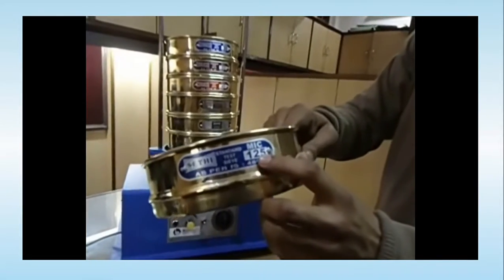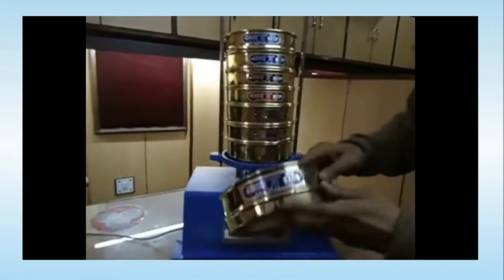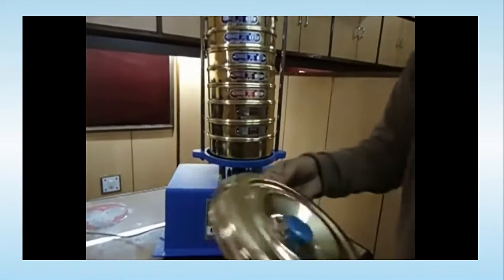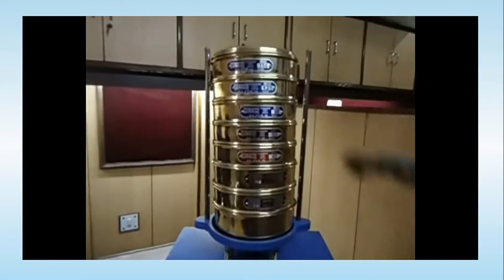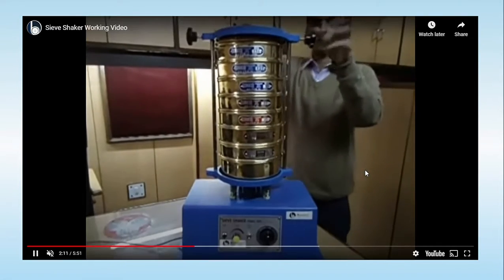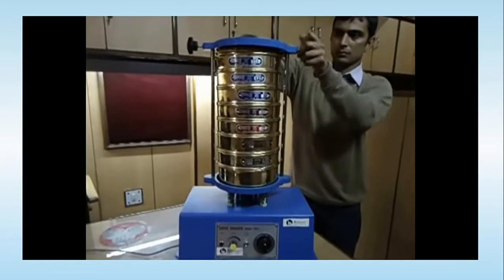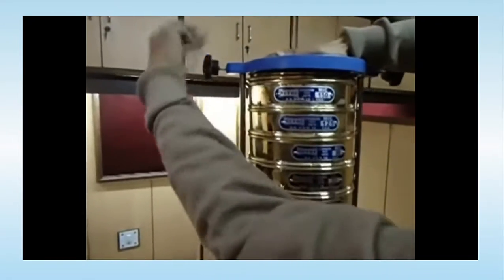Now, the sieves shown here are arranged as per the sieve number or their wire mesh size. And this is the lid which is kept on top, because as the vibration is applied, it will not produce dusting. Now it is fixed on the mechanical shaker, and then the machine is going to be rotated at a specific speed for a specific period of time.